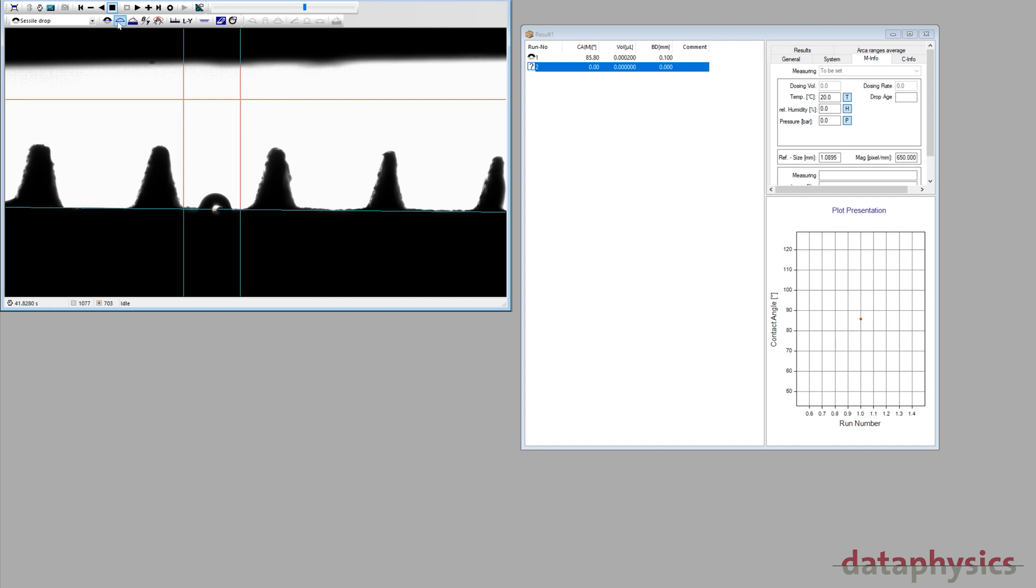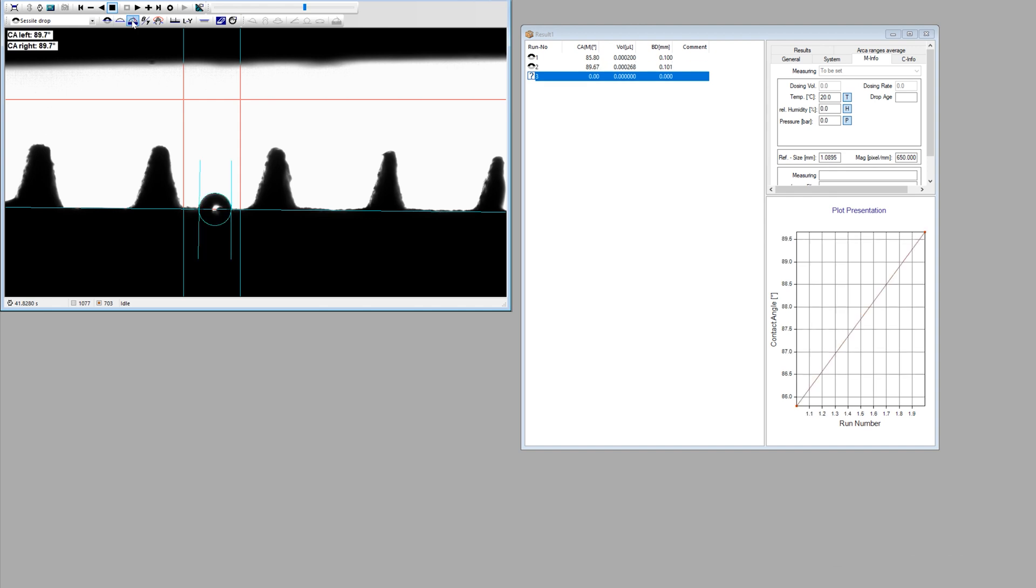After defining a region of interest, the drop is automatically analyzed and the contact angle measured.